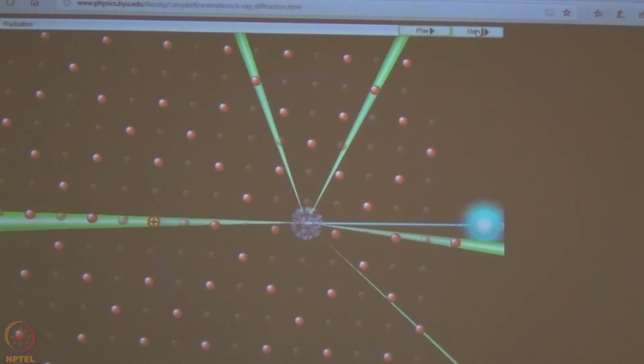Width means the angle by which you rotate the crystal. Either you rotate it about its own axis, which is called phi, or you keep the crystal like this and rotate it like that, which is omega. Normally we do phi and omega scans, but it is possible to keep the crystal exactly vertical or exactly horizontal. The angle the crystal makes with the horizontal plane is called kappa.